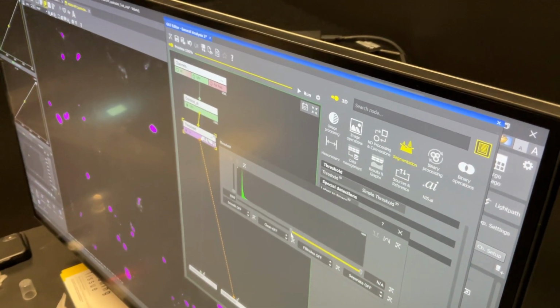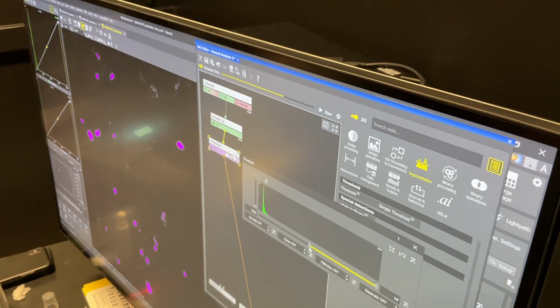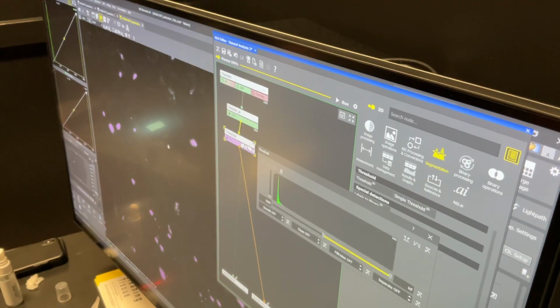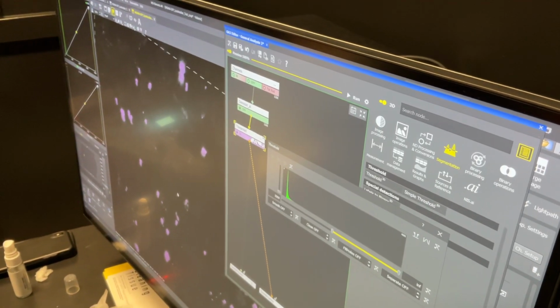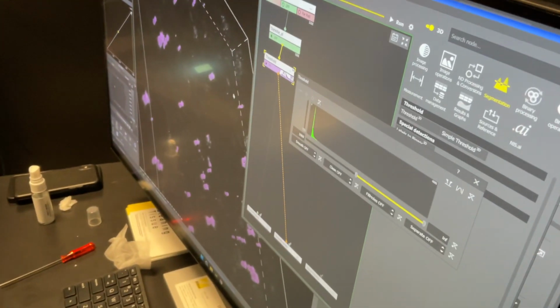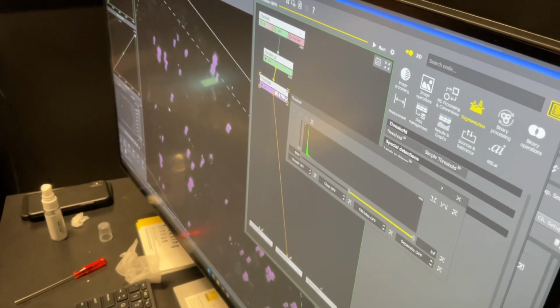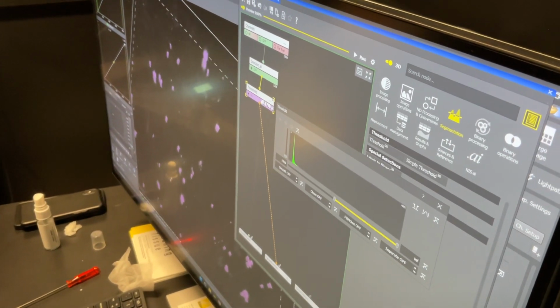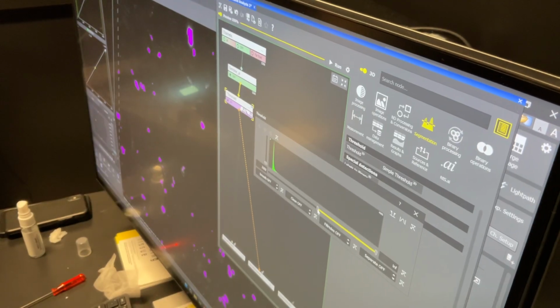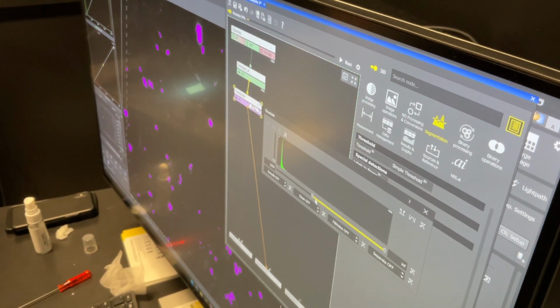Does that look good? Yeah. Do you think some of the smaller ones are there? Some of them, near the bottom, I don't know. I mean, we could probably take it higher or lower. Do you want to cut out more things? Or higher, yeah. We can cut out more things. Maybe they are, I don't know. I guess it's pretty consistent. I think so. It's probably fine. For proof of concept, it's fine.